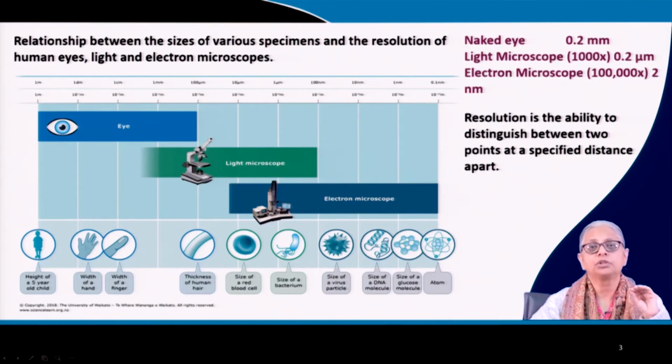Now, we want to visualize these microbial organisms. These are single-celled organisms. Can we look at them? We know we cannot look at them without some kind of tool. And the best tools that we've all been familiar with for quite some time are light microscopes. I think most of you in high school would have used a light microscope, which is also called an optical microscope.